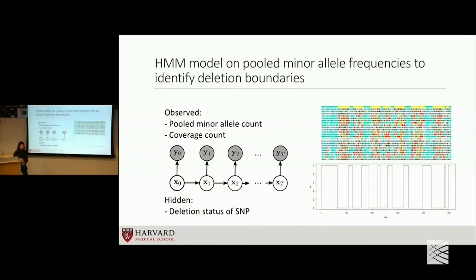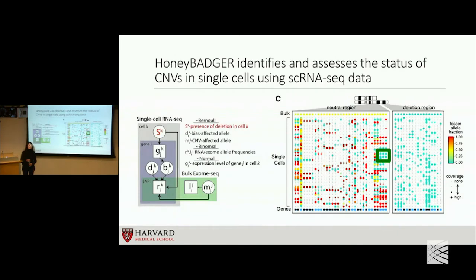Question. Is there a difference in genes where both alleles can be detected, like the third column versus the other column? Yes, in general, I would expect this gene to be much more highly expressed than this one. Yeah, we've shown previously that this monoallelic rate is a function of gene expression magnitude. And that gets back at how this is probably a measurement phenomenon.